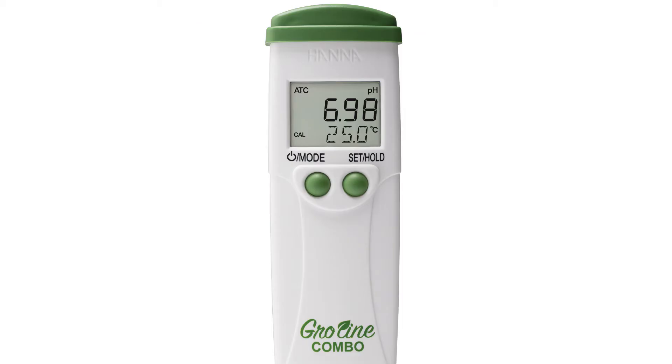To set up your tester to your preferred settings, press and hold the mode button for six seconds until you see the unit of measurement. Press the set hold button to choose between EC measurement or TDS factors of 0.5 (500 ppm) or 0.7 (700 ppm). Once you have chosen your preferred unit of measurement, press the mode button to choose your calibration type.